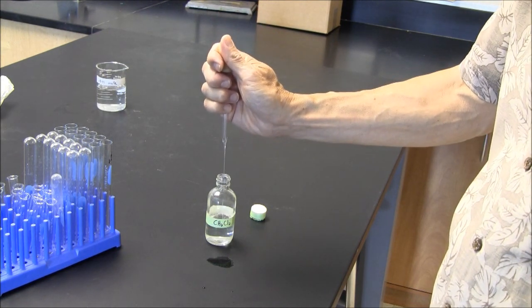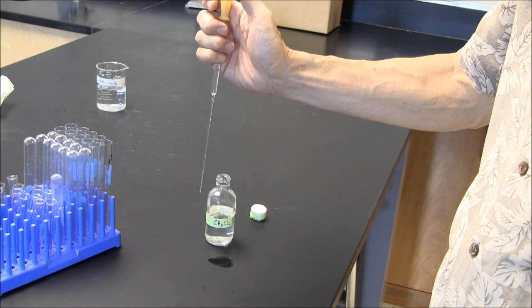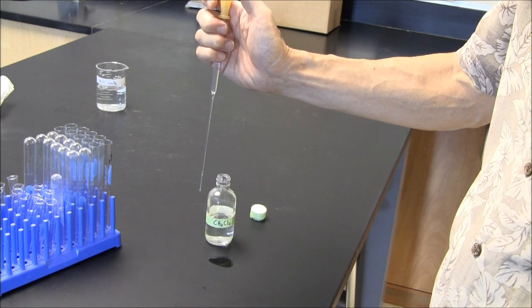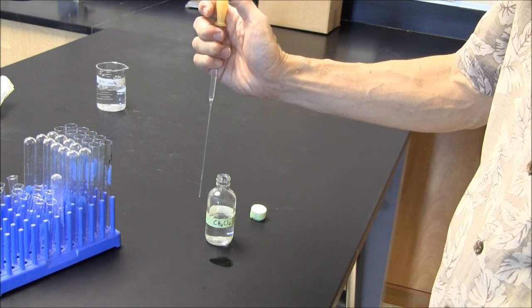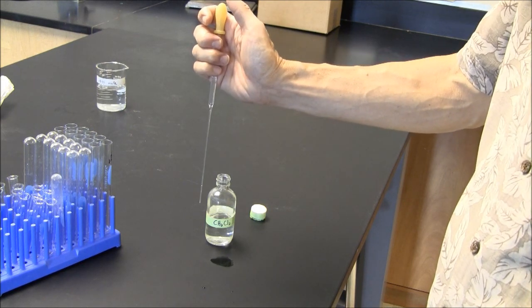And I have a much better chance now of having it not drip. Still, I don't want to wait too long, so I should have my vessel prepared for receiving the dichloromethane. But this is a good trick to keep the dichloromethane in your pipette.